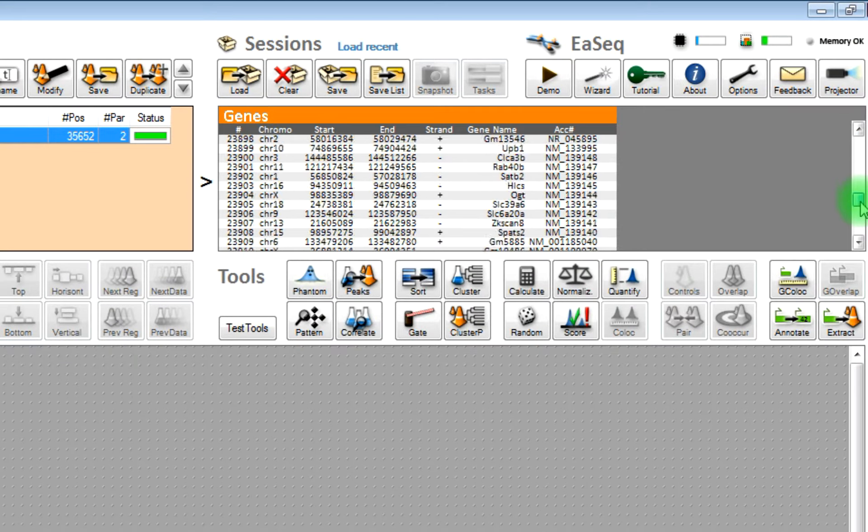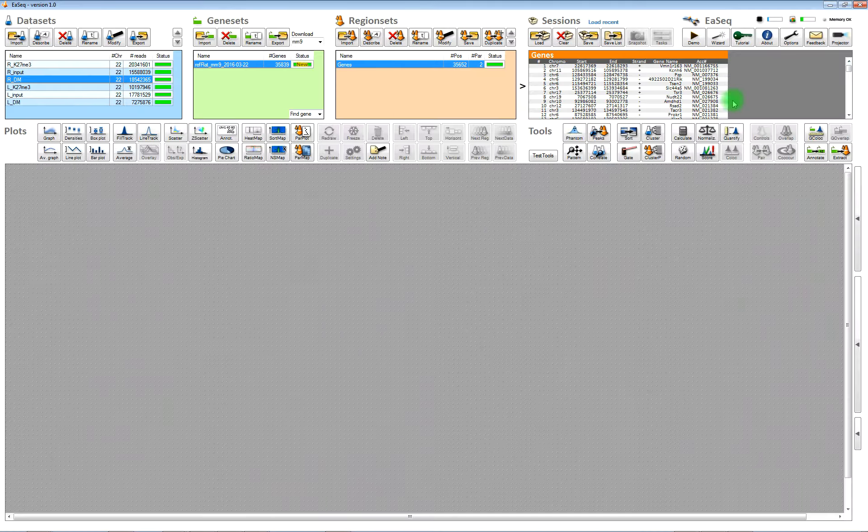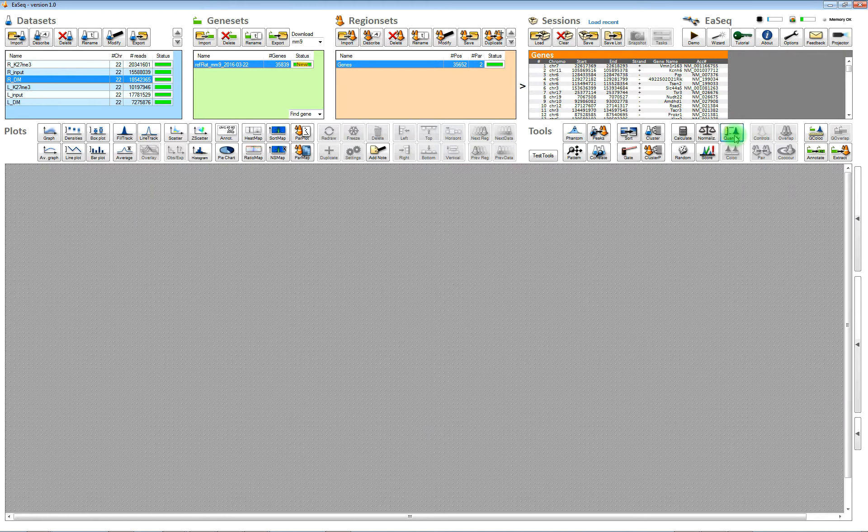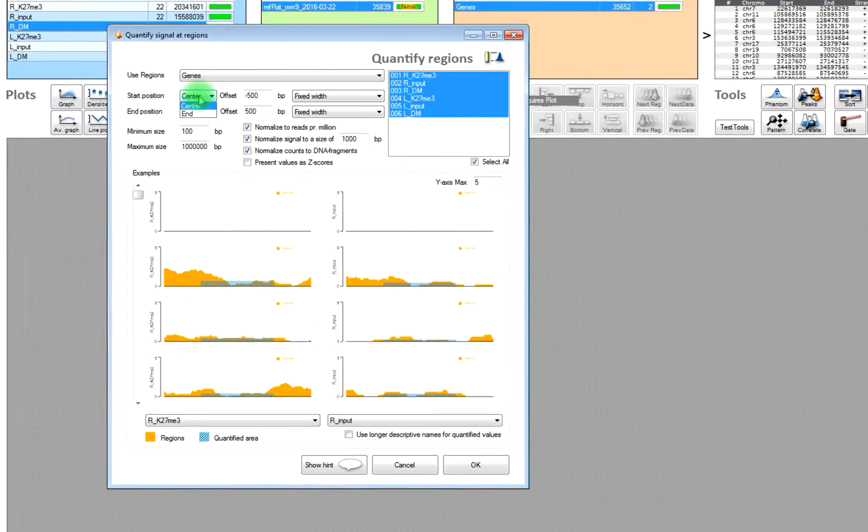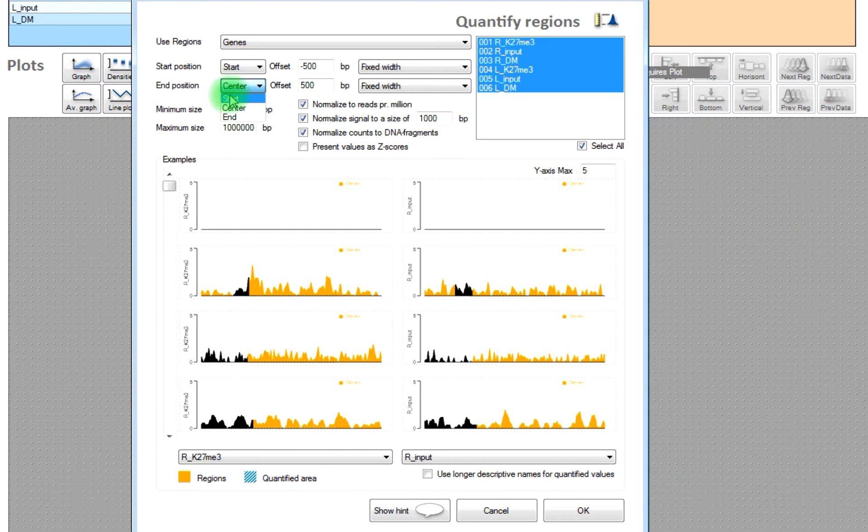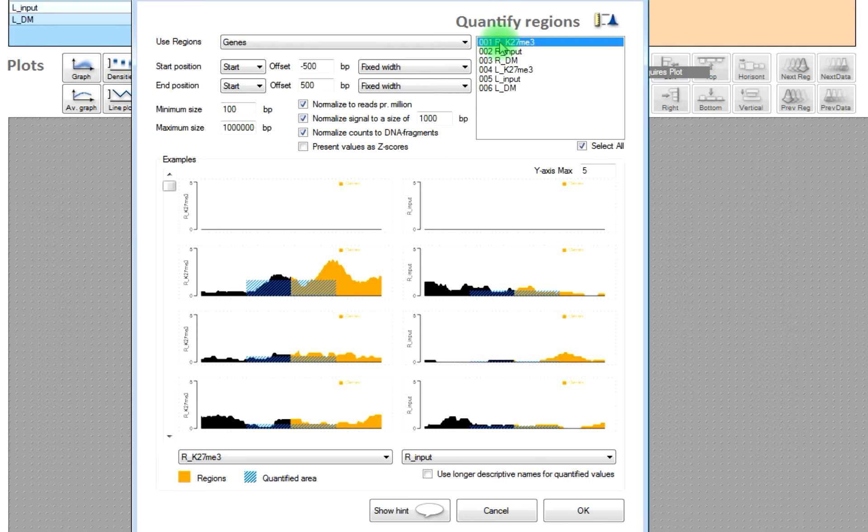You can see the list of genes here and once you have the genes, then you can start to quantify the amount of chipset data. Here we'll quantify the level at the transcription start sites, so that corresponds to the starts of the regions.